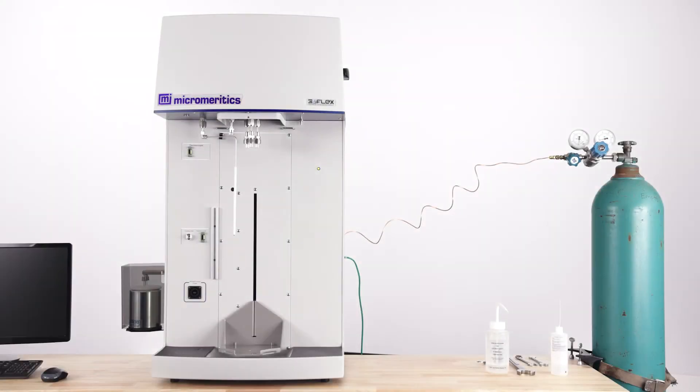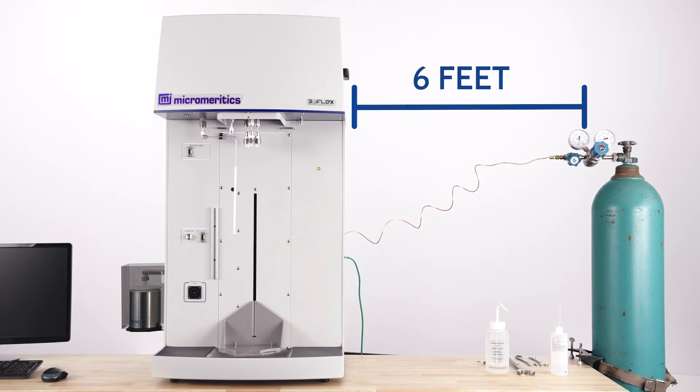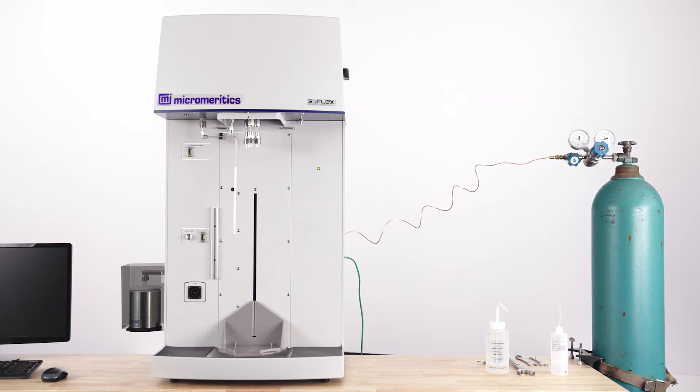Gas cylinders should be installed and secured within six feet of the analyzer in a well-ventilated area. Longer distances will increase the difficulty in evaluating ambient gases residing in the tubing.